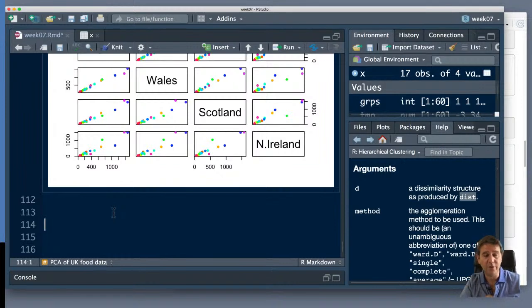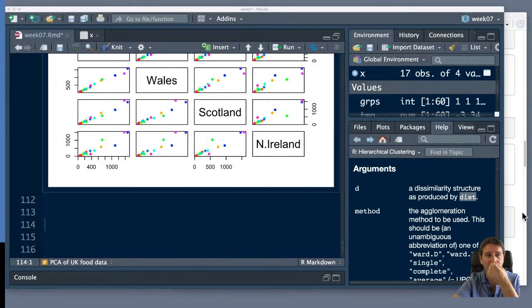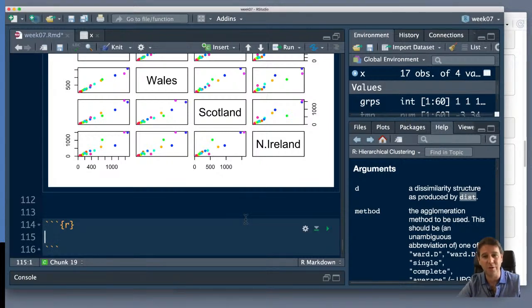Okay, so enter PCA, kind of PCA to the rescue here. So let's start doing our principal component analysis of this data set. We're going to run the main function for PCA called prcomp. Here in R, there's lots of principal component analysis functions in add-on packages, some of them really nice that do it, for example, for genomics data in Bioconductor, or biomolecular data in Bio3D and other packages.